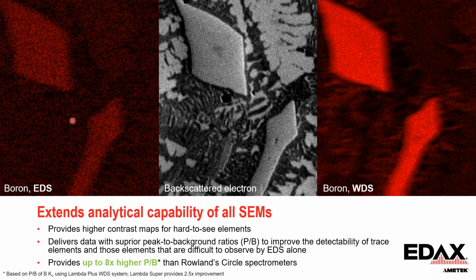These are boron EDS and WDS maps from an alloy sample. We see the boron EDS map is noisy, but the boron WDS map has very high quality. This is due to WDS having a superior peak to background ratio.